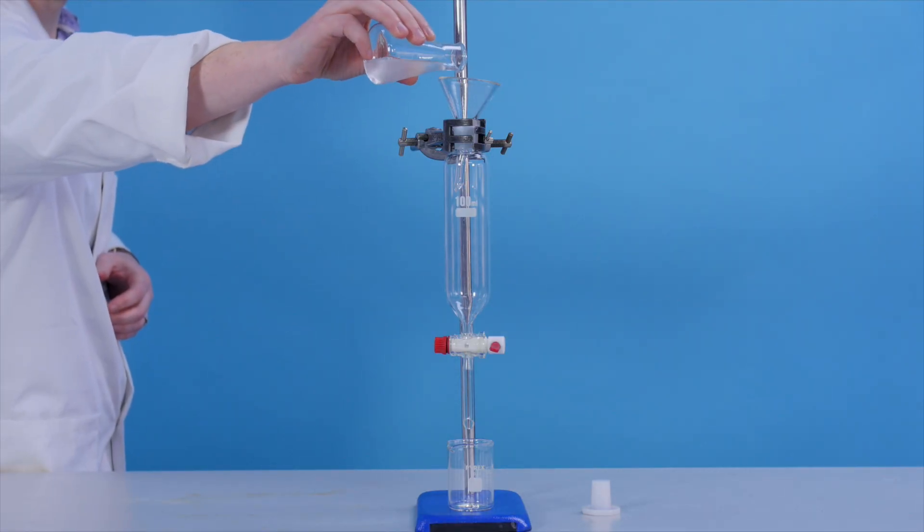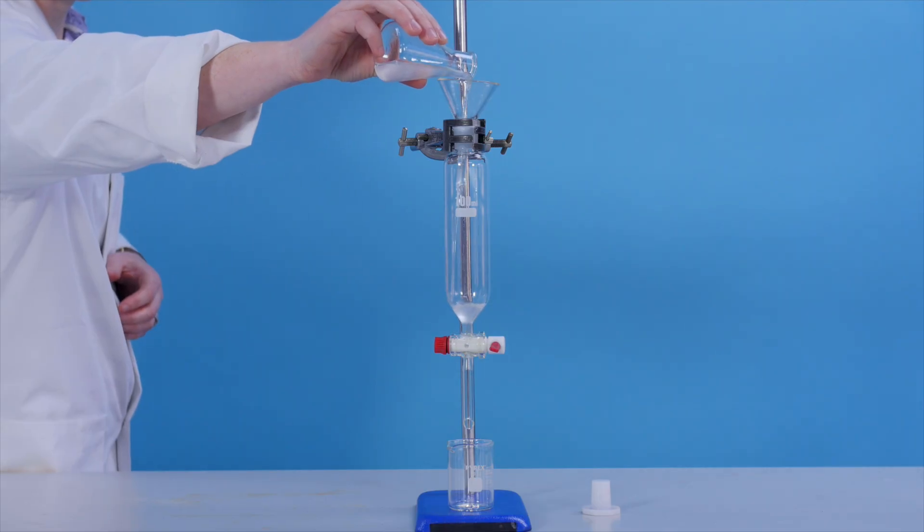We have made our product and separated it from the reaction mixture. Now we need to purify it. Transfer the impure cyclohexene to a separating funnel.